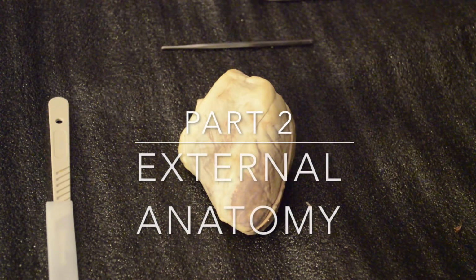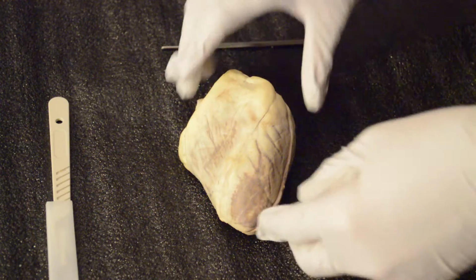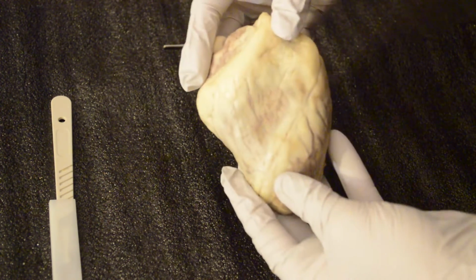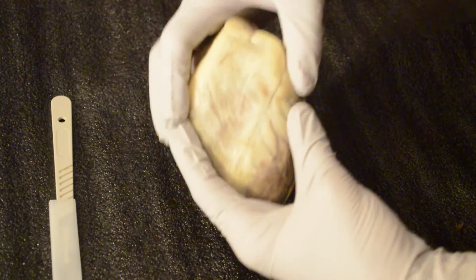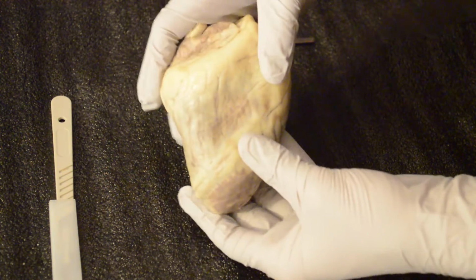All right, here we have part 2. We're looking at the external anatomy of the heart itself, and going into small detail here. The epicardium, or the visceral pericardium, is the housing part of the heart itself. It's the outermost layer. This is again what houses the heart itself.